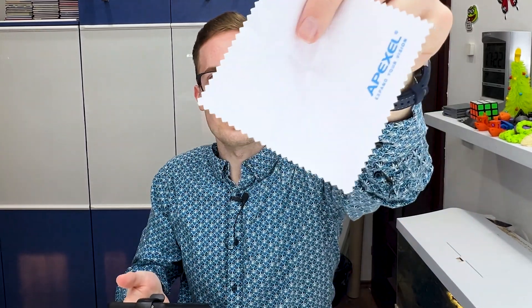For example, this cloth that they gave us in the package. Here we can see the letter R and how it is painted on the cloth. Let's also zoom in digitally — this is really close, the letter R right here.